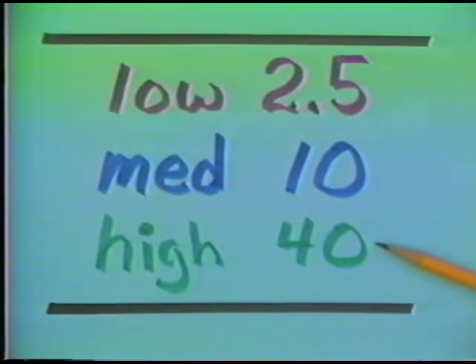You can get a rough index of the total magnification that a microscope is providing by multiplying the magnification of the objective times the magnification of the ocular. For example, in this particular case, for our medium power, which is a 10x objective, multiplied times the 8x ocular, we have an approximate total magnification of 80x.